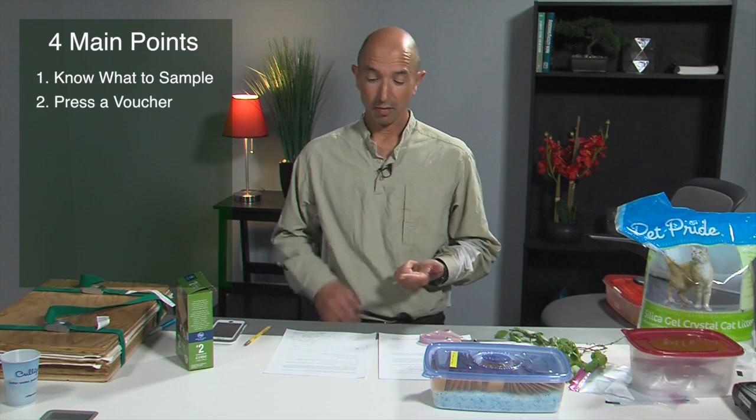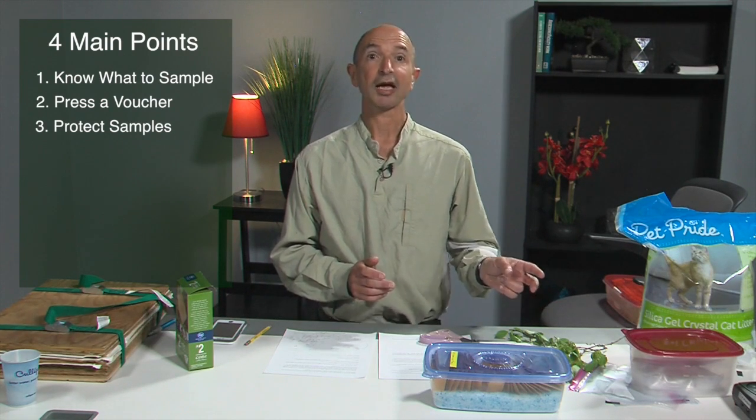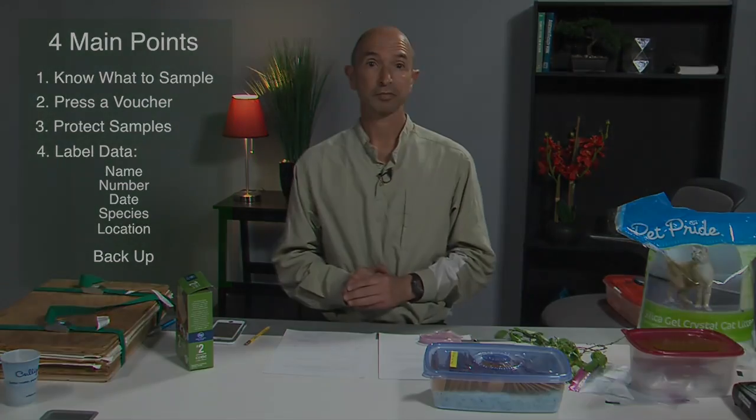Okay, so the 4 main key points. 1, make sure you understand from the researcher what needs to be sampled. 2, make sure that you have a voucher specimen. 3, make sure that your sample for DNA is protected both from moisture using sufficient amounts of silica gel, and then also protected from the silica gel by having an envelope or coffee filter. And finally, make sure that all your samples are labeled clearly with your name, perhaps a unique number, the date, the species, and then the locality information. And always make sure that that information is backed up somewhere, not just on the sample, but also in a field notebook or a spreadsheet.